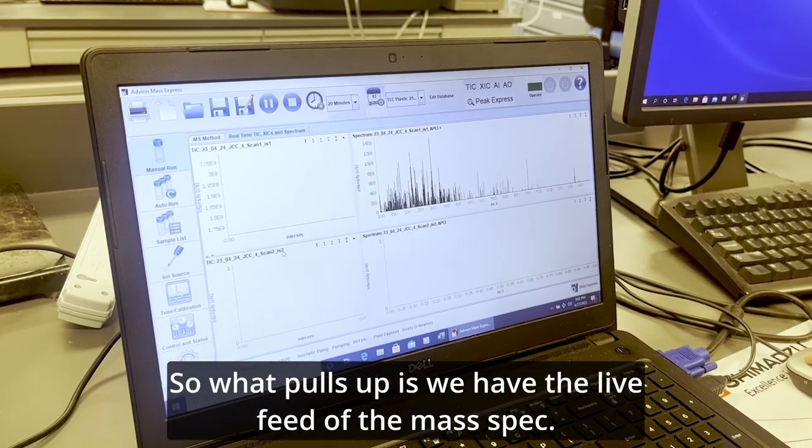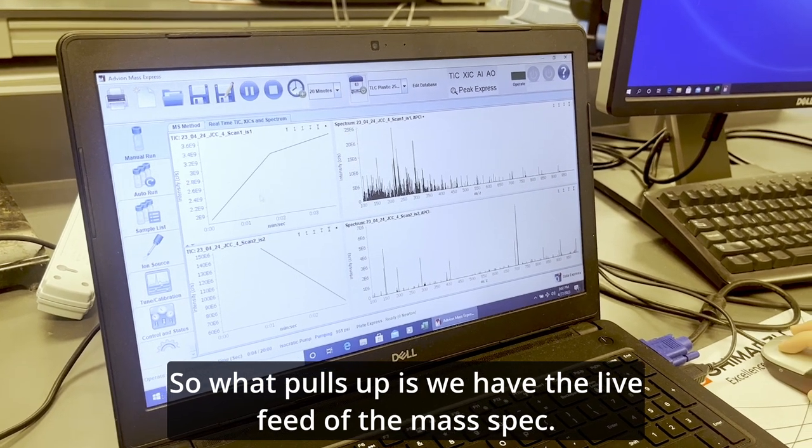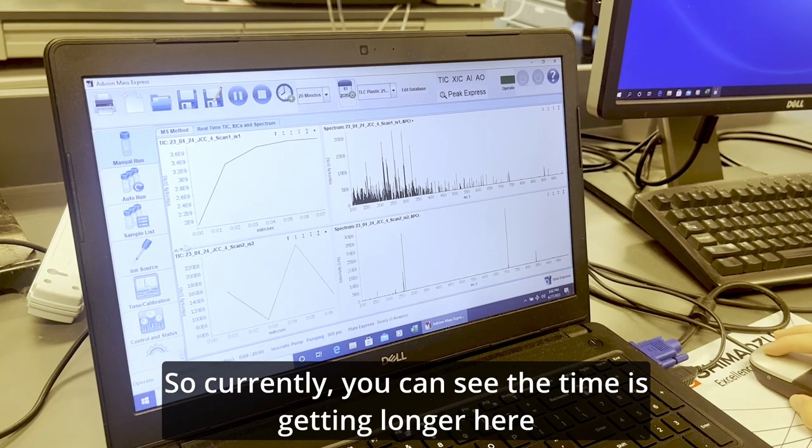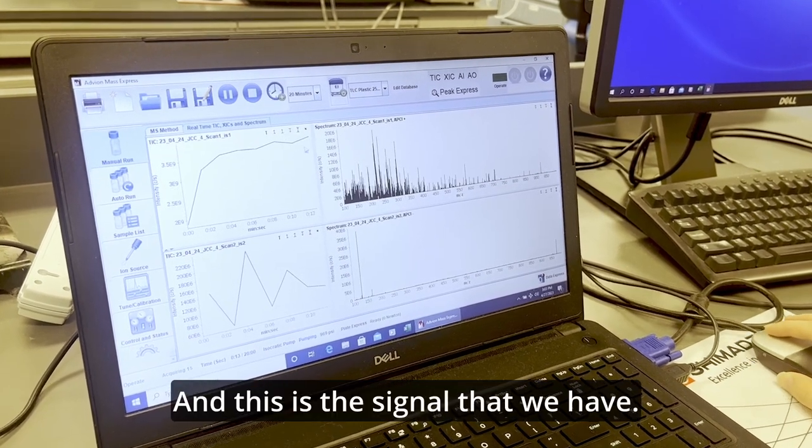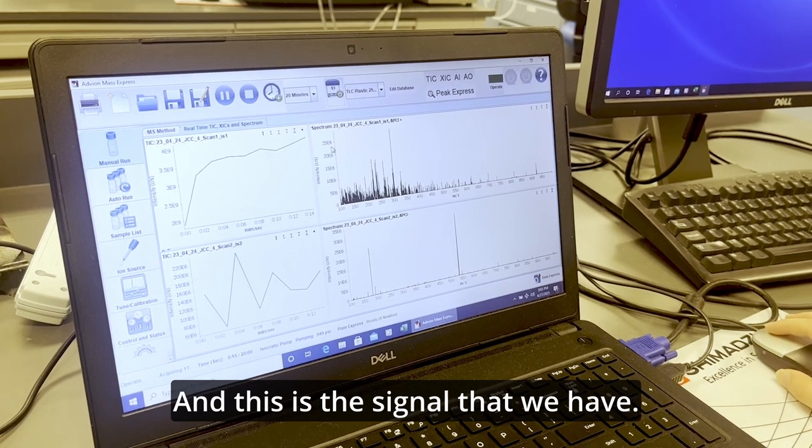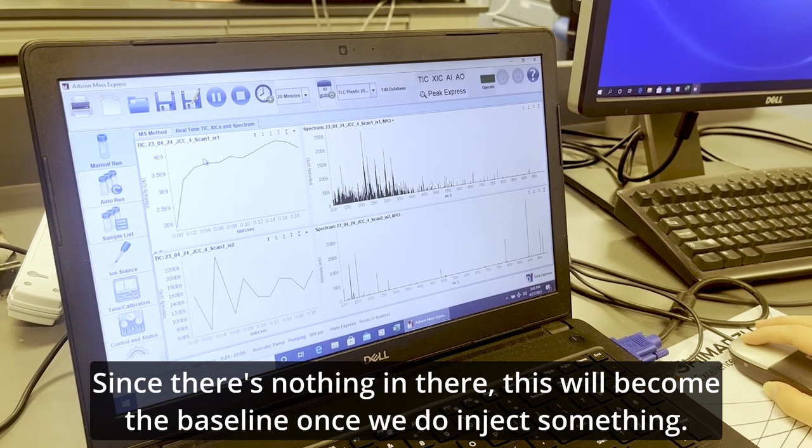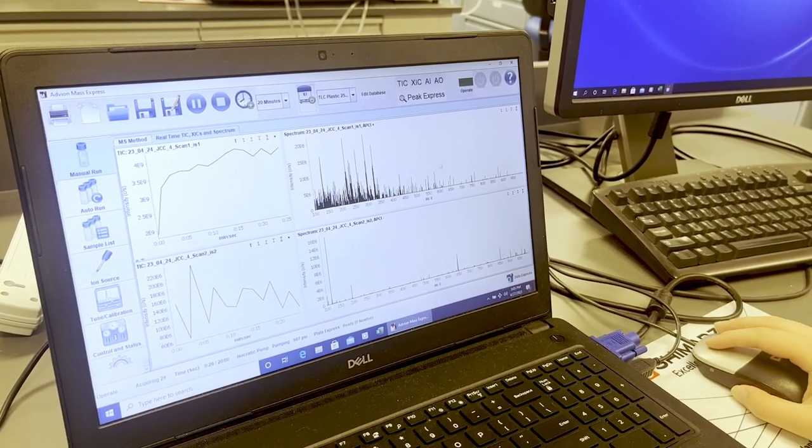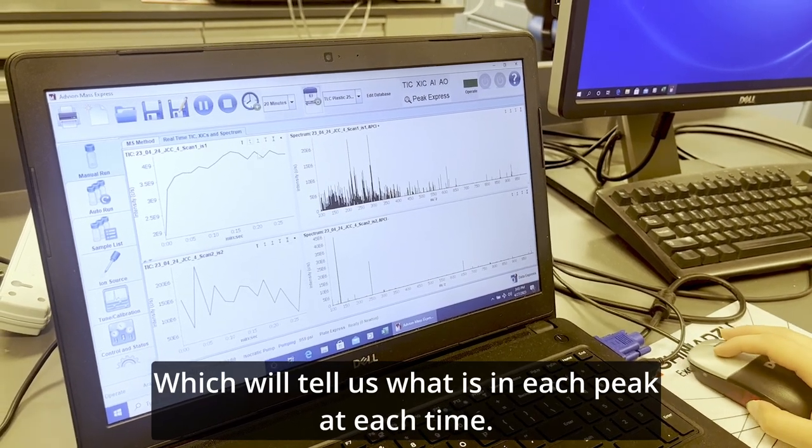So what pulls up is we have the live feed of the mass spec. So currently, you can see the time is getting longer here, and this is the signal that we have. Since there's nothing in there, this will become the baseline once we do inject something. And then over here is our mass spectrometer data, which will tell us what is in each peak at each time.